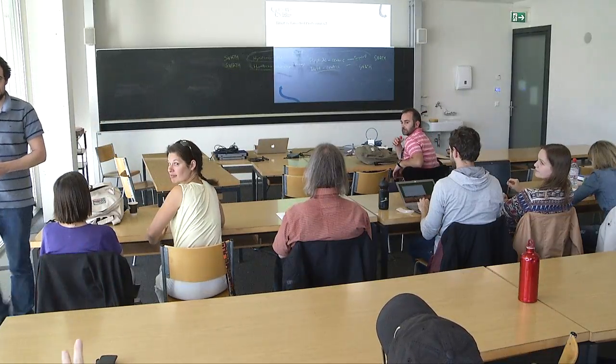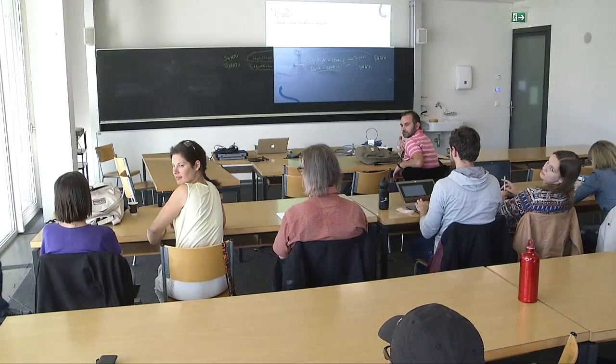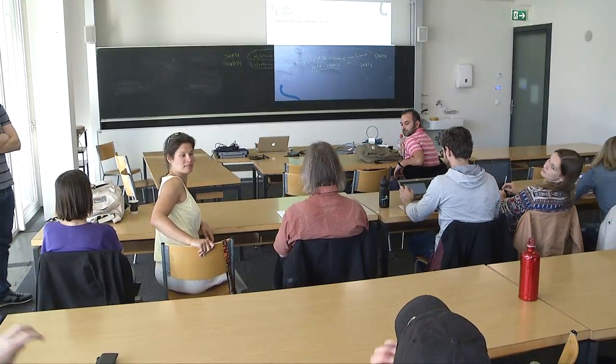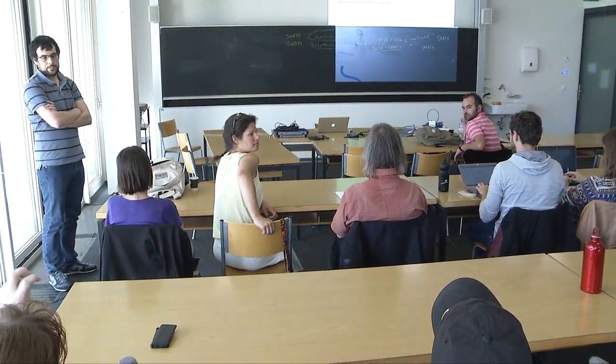What to call swath? Swath was actually coined by ETHZ, and when you are measuring DIA with the Thermo instrument, the Q Exactive, you are also using these m/z intervals. Then it's swath, and DIA could be MS-everything also. So is that the difference, or is swath kind of an analog definition of DIA? Where do we have to draw the line then?